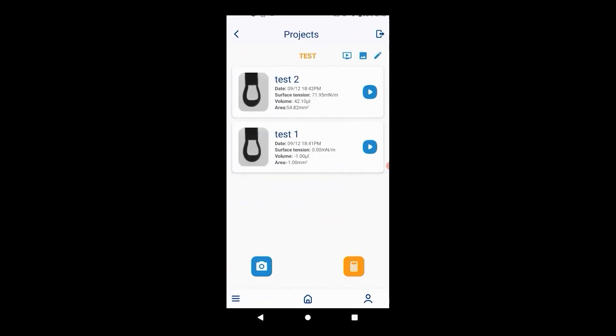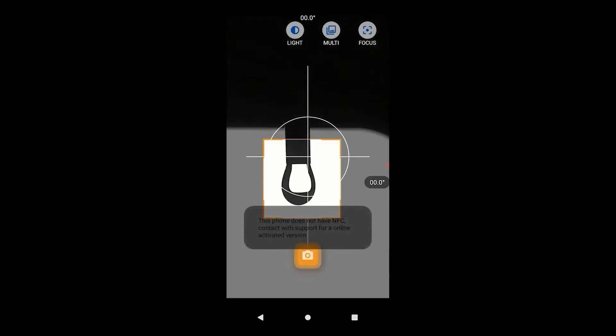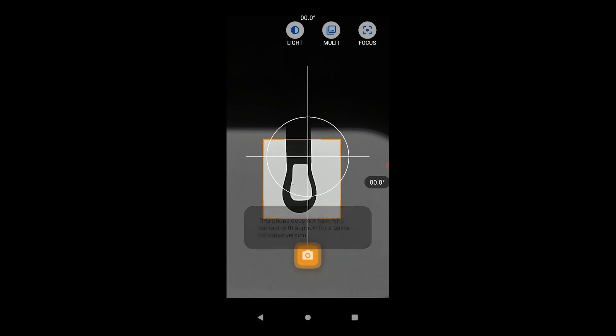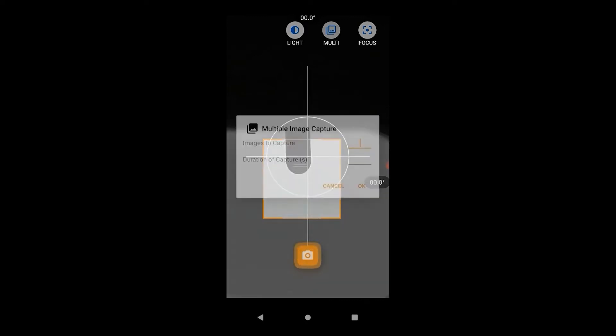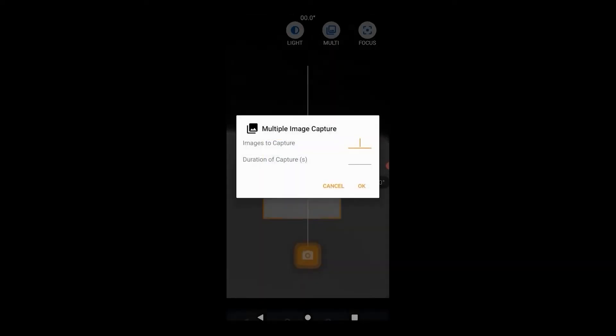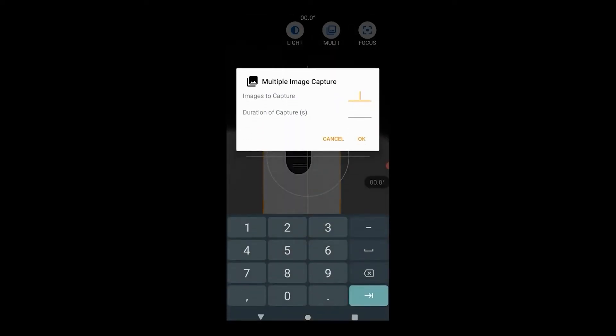This can be used as a foolproof way of measuring the surface tension by generating the droplet slowly and taking the image right before it detaches from the needle. It can also be used to measure the dynamic surface tension.